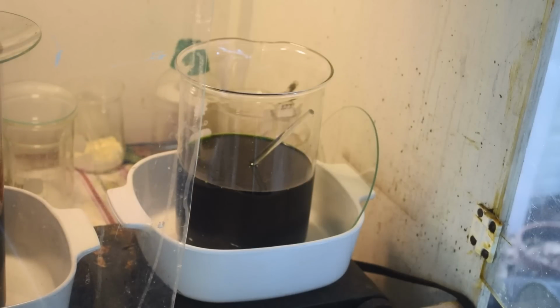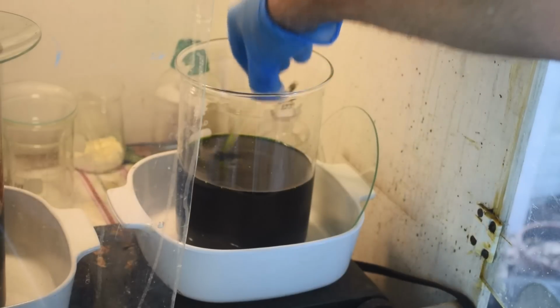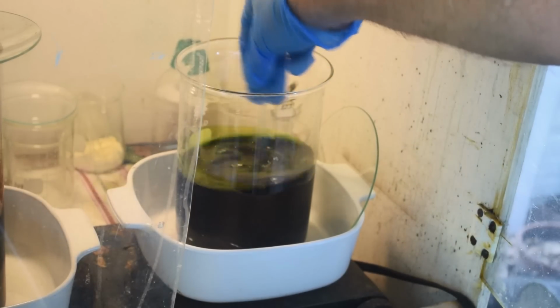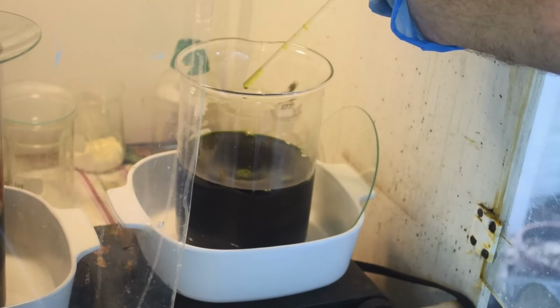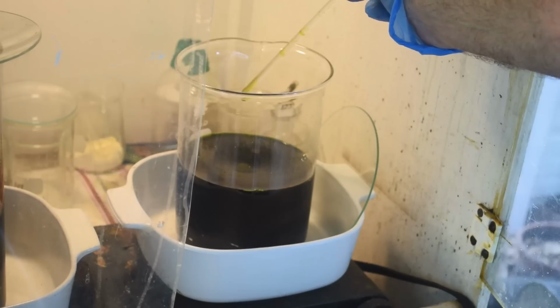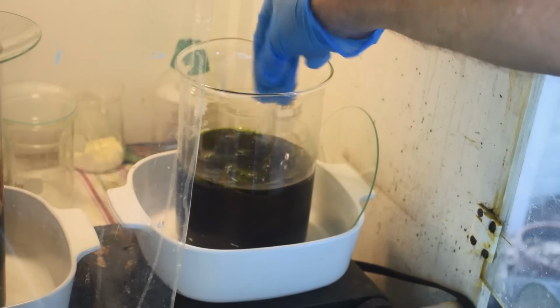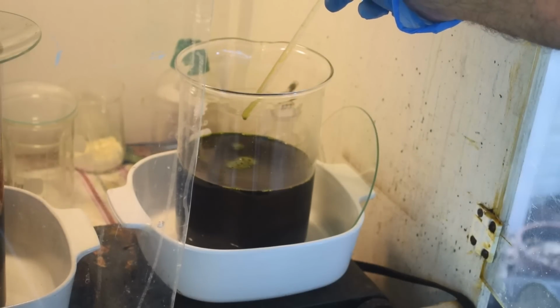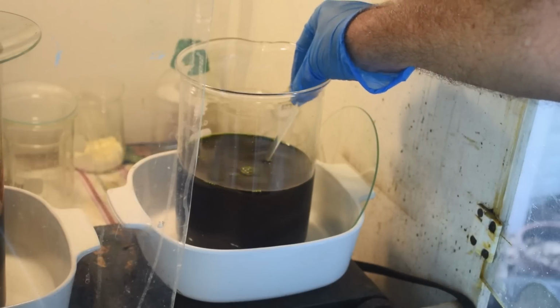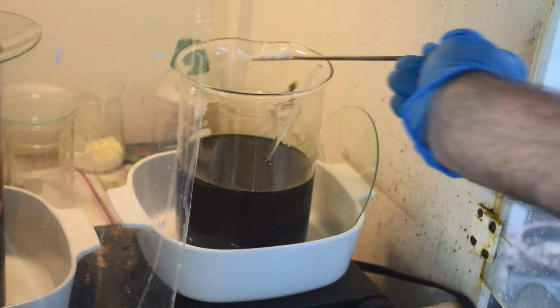All right. One to start with. This is how it lulls you into putting a lot more in. I am running at a lower temperature here. Don't see any red precipitate yet, and there wasn't a lot of foaming either, so we will put one more in.